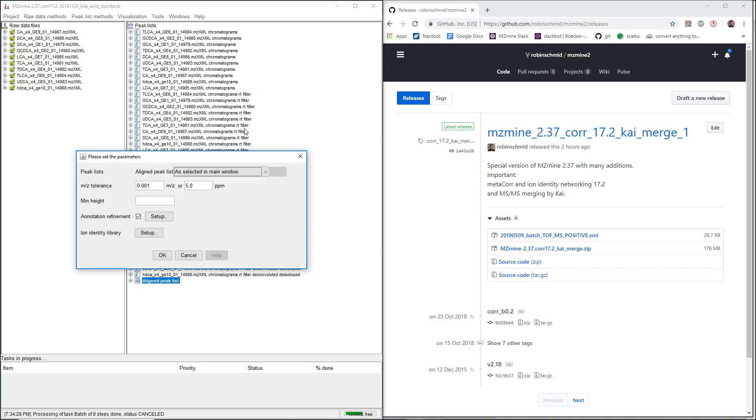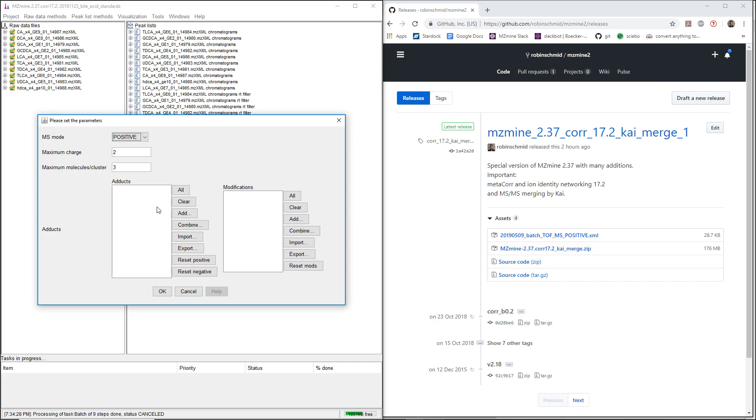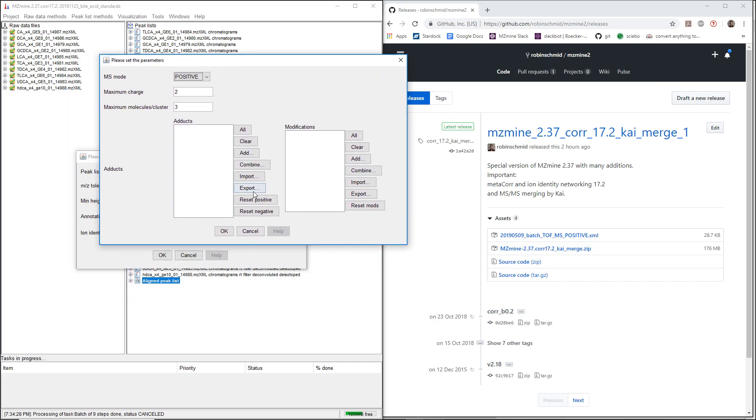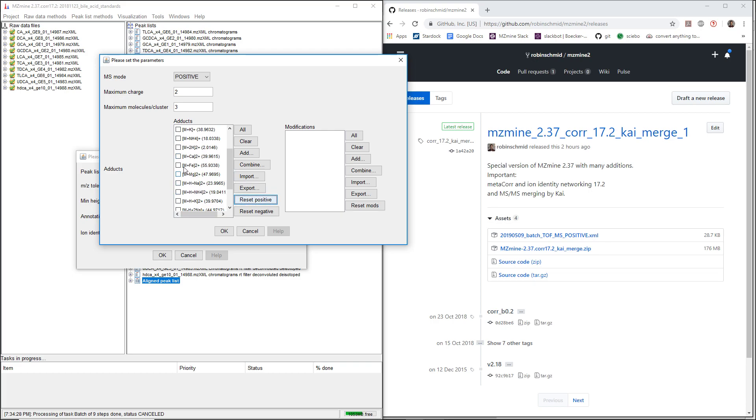It's the same module, basically, but this module only runs on existing networks, and we can just define more of the weird adducts, for example, iron or calcium and so on.